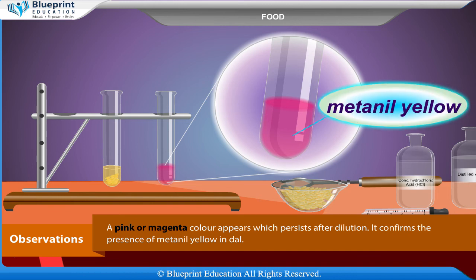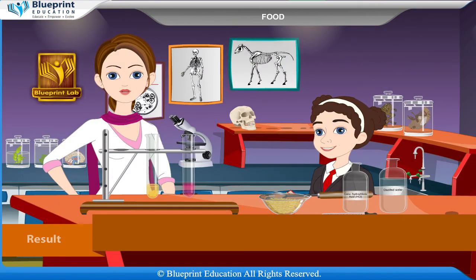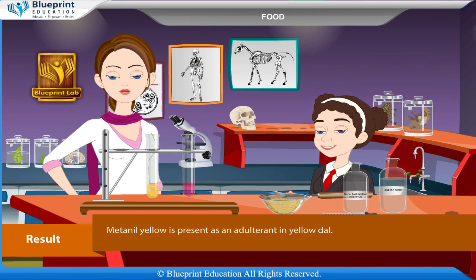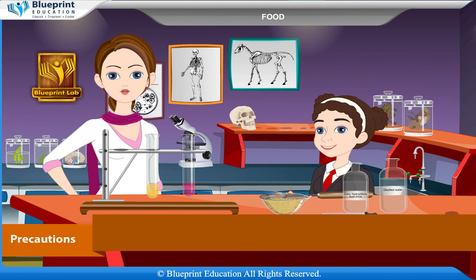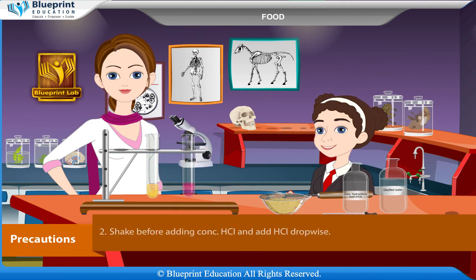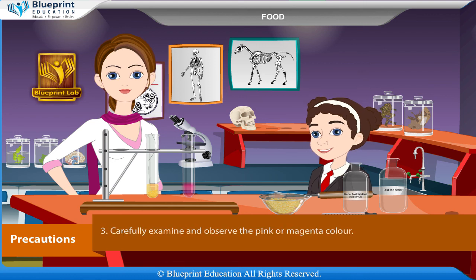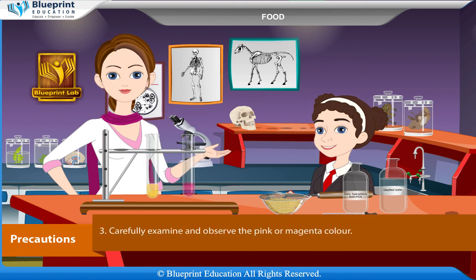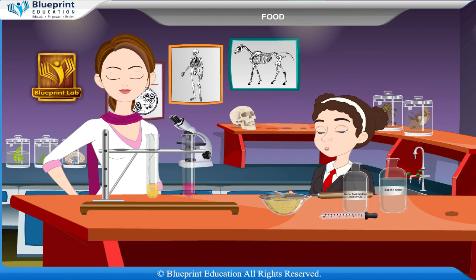Observation: a pink or magenta color appears which persists after dilution, confirming the presence of metanil yellow in dal. Result: metanil yellow is present as an adulterant in yellow dal. Precautions: handle the test tubes carefully; shake before adding concentrated HCl; add HCl dropwise; carefully examine and observe the pink or magenta color.